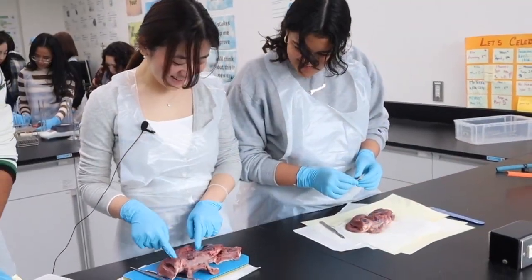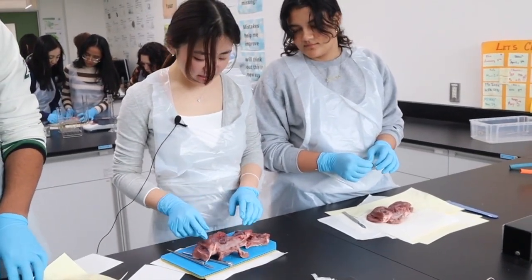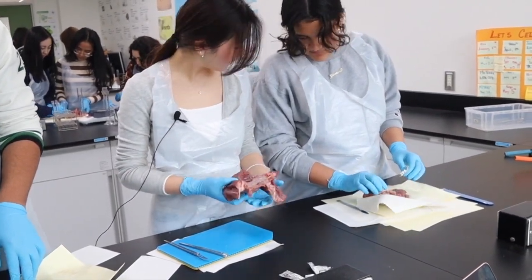So I think this is the left ventricle and this is the right ventricle because this has much more muscle than this side. But I don't know, do you know where the right and left atriums are?